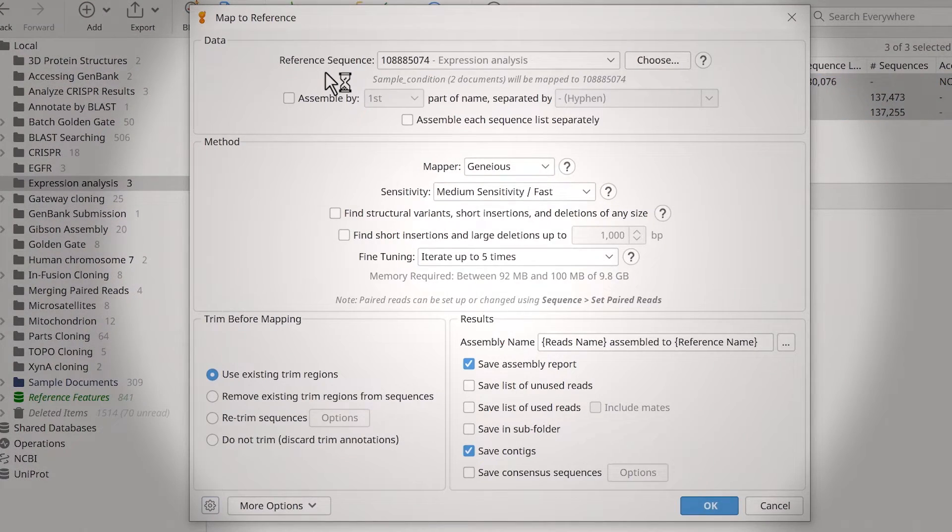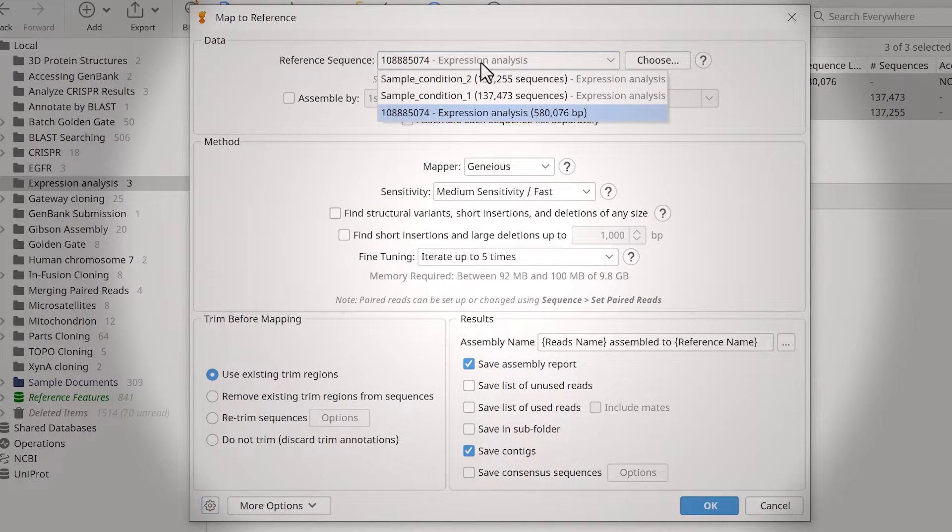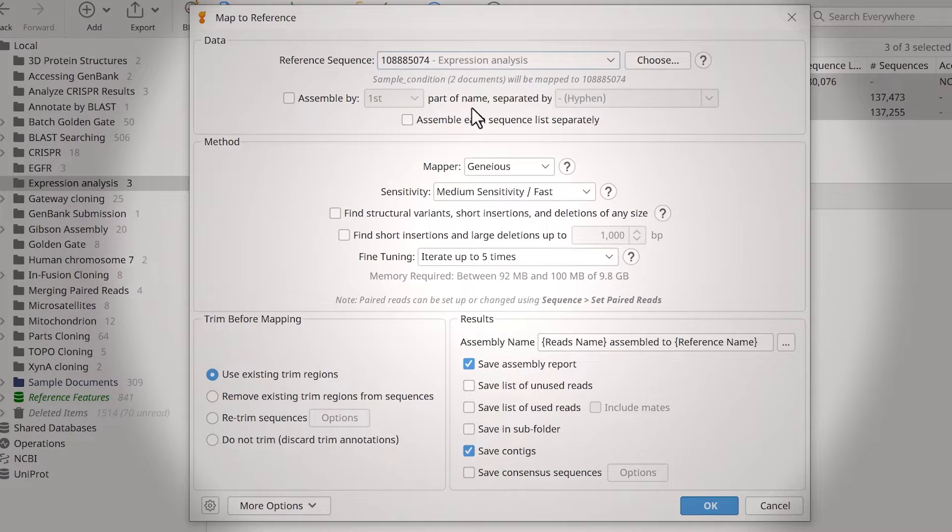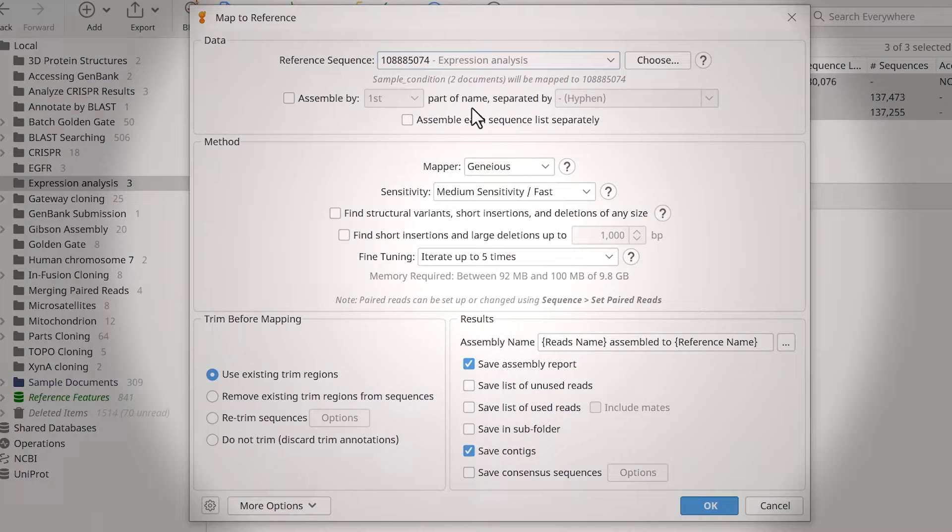Ensure you correctly specify your reference sequence at the top. You can use the drop-down menu to identify a different file in the same folder, or select Choose to select a file in another Genius folder.